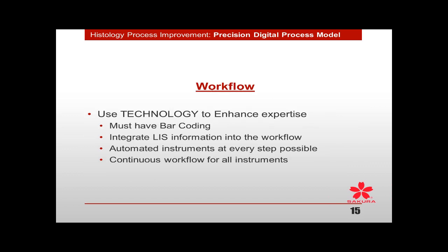So you have to use technology to enhance your expertise. And again, you can do it. I just don't know how you're going to effectively and efficiently integrate this humongous IT-dependent process now without having barcoding. Having somebody sitting at a computer terminal trying to pull all this together without barcoding is just going to be too cumbersome and just not doable.